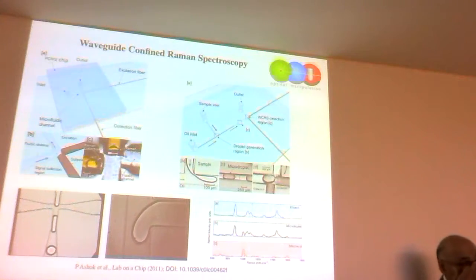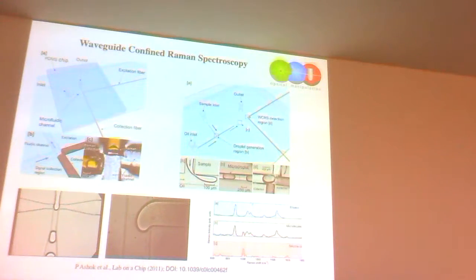Yeah. And when you consider this a small amount of material, so are the properties would be the same compared to, you know, the bulk thing? And then how this Raman signature is, you know, helpful for quantitative characterization of the changes?